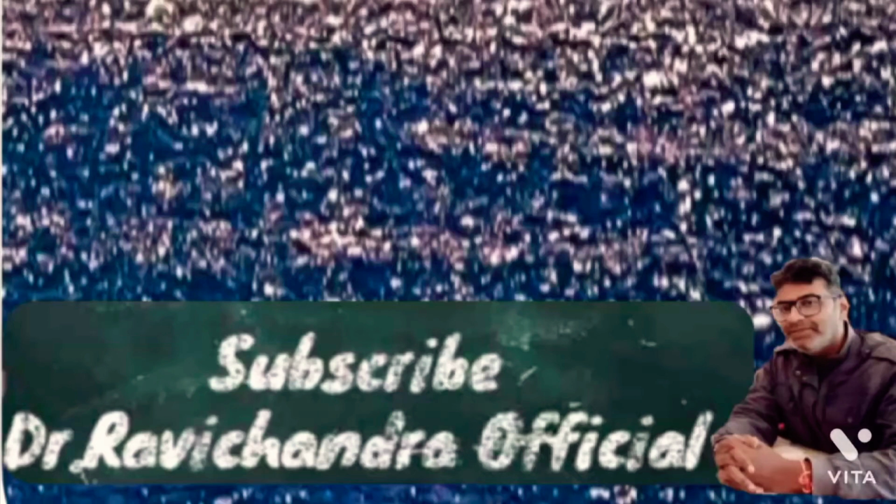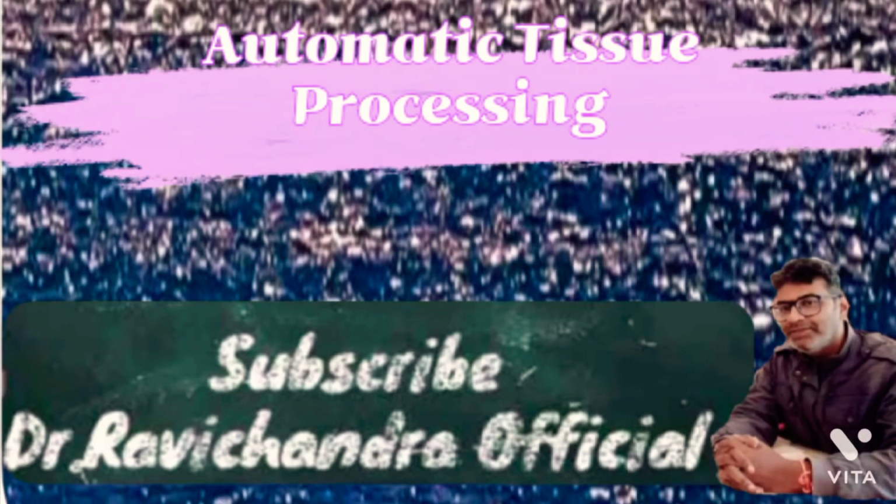Hi, hello everyone. Today we will discuss automatic tissue processing. Tissue processing is a procedure which needs to take place after gross examination, between the tissue fixation and embedding and then sectioning of the paraffin blocks. It is called tissue processing.